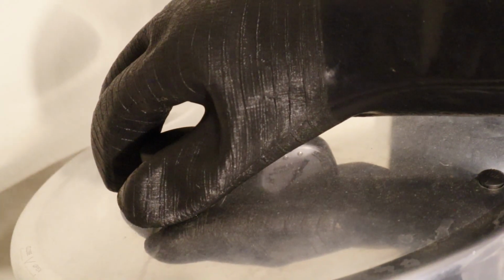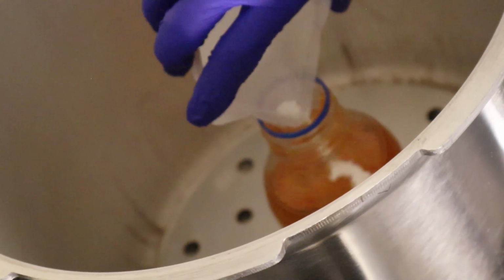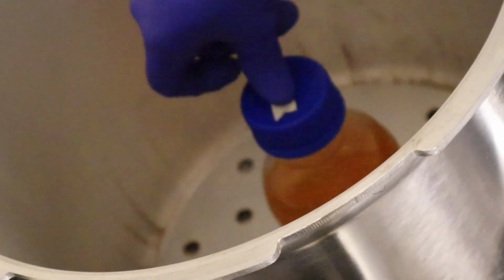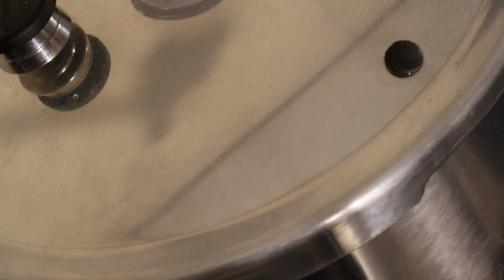I had to end the autoclave early, and you remember that calcium carbonate I weighed out earlier? I never added it. So I had to add the calcium carbonate so the pH stays adjusted, and I had to add a piece of autoclave tape on top. I then, for the second time, sealed the lid and put on the 15 psi pressure regulator.